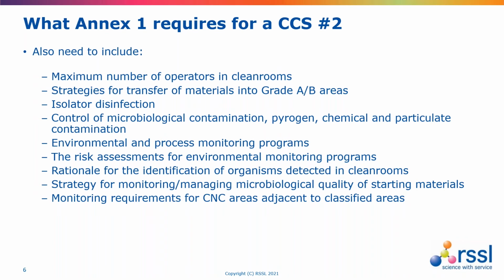A lot around controls of freeze drying, how the environmental monitoring program is developed and how that relates meaningfully to the contamination control strategy so that the environmental monitoring undertaken is with value. Also covering things like which microorganisms are to be identified and what is actually done with that data.